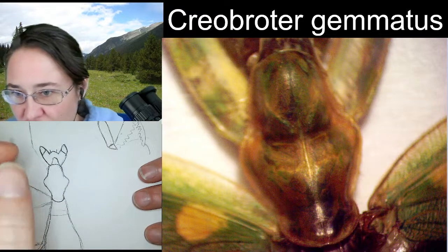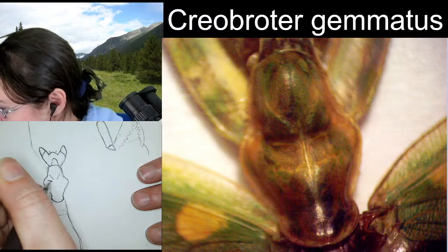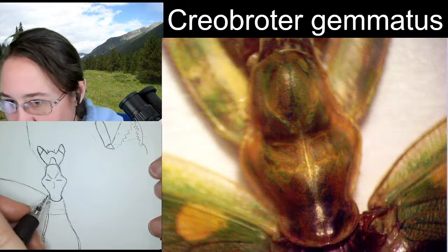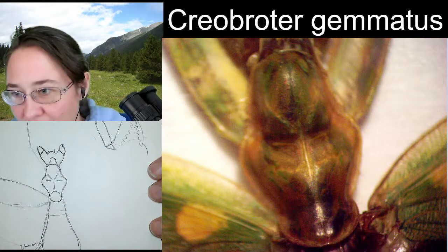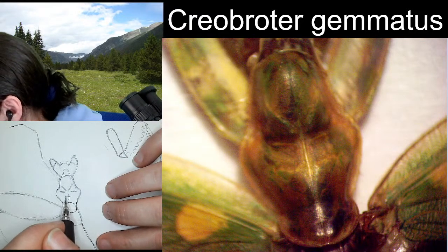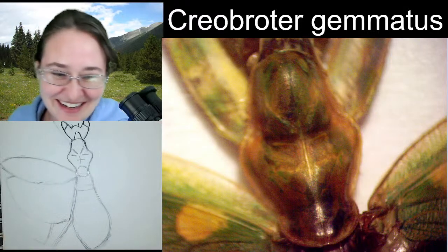And it almost looks like an angry face if you add these lines here. Because you've got that dark here, and then it almost looks like it has white angry eyebrows, and then a nose, almost like an angry face. Yeah. This is what I see. I think that's pretty realistic, too. Outside of maybe there's actually an additional little, oh, that's even worse. Look at that. Yep. So that's what the pronotum looks like. I love it. Good job, guys.